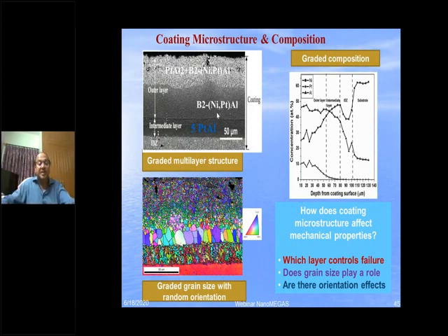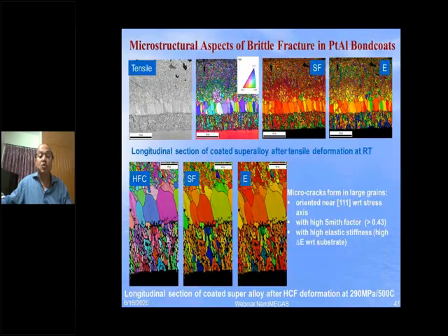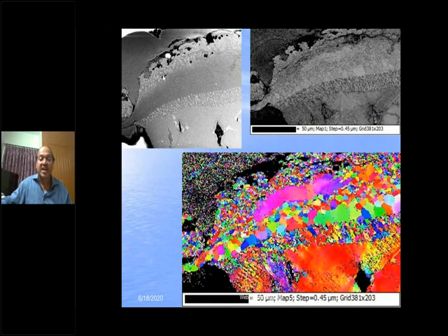Now look at this same thing in the EBSD. You have various types of grain structure, elongated, multi-grain, and actually it is coming to the metal here. Now, to find out how the cracks are happening, these are microcracks. So we can look at these cracks now. We are not able to observe them only in SEM. So after a thorough investigation in SEM and EBSD, we were not satisfied, so we went for a particular region of analysis. You can look at how we can find this out using EBSD.